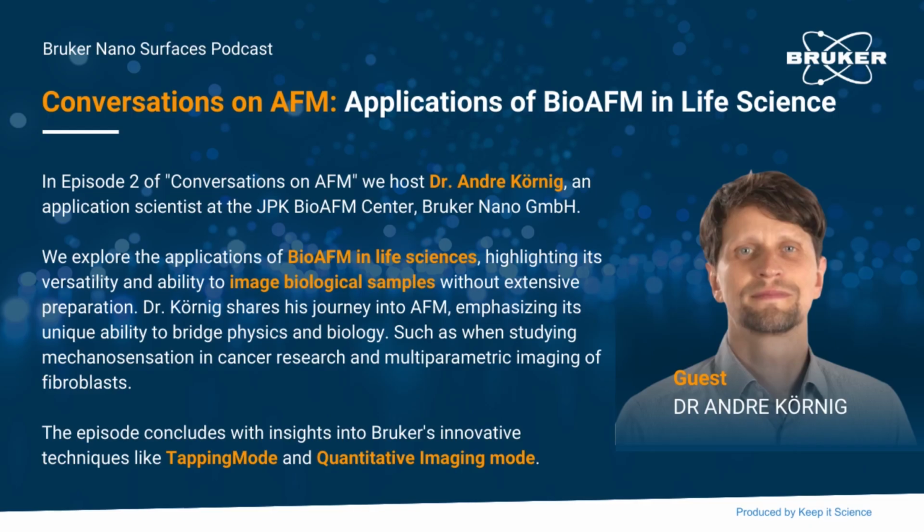Or what other people do, I think this is also highlighted there, is that you can connect some molecules on your cantilever, and while you're imaging, you would see counterparts of it. So you can also measure ligand and receptor interaction while you're imaging, and you can localize it where you see it. So this is what multiparametric imaging is about. You don't get only the topography as it is known from the AFM, but you can access a lot of information by taking just one image and analyzing the force curves, as we call them, that you have while you're doing the imaging.